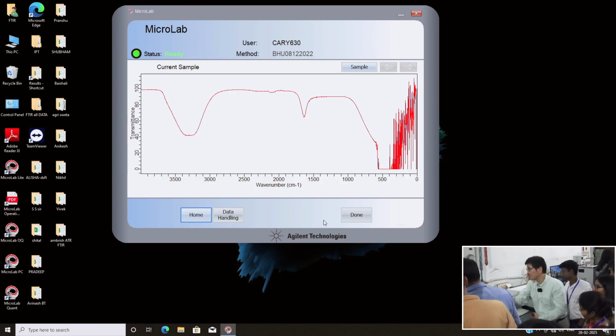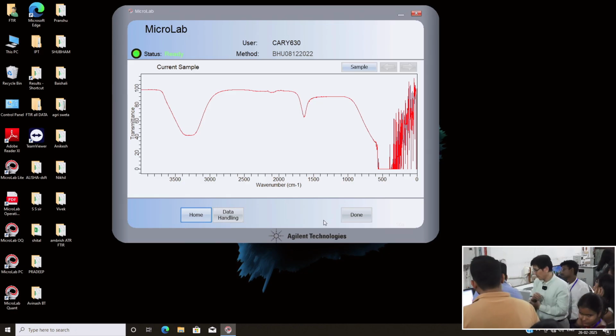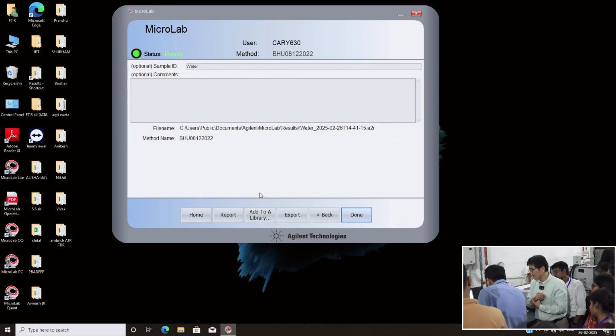Then would you save this data? It is water. Would you save it? Save, export.